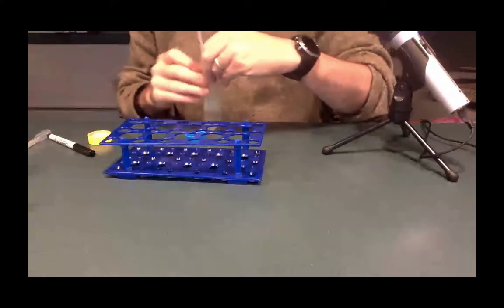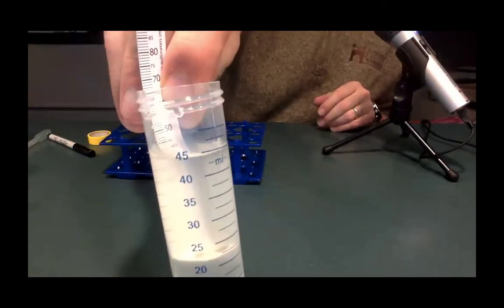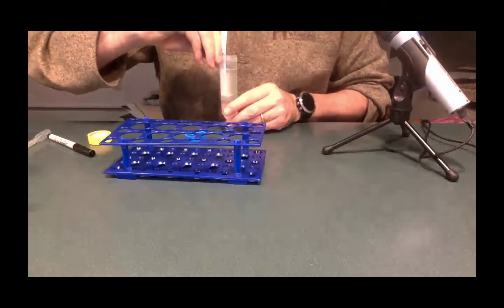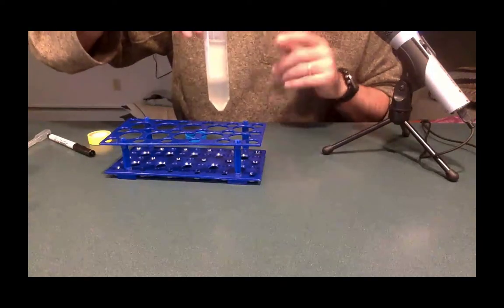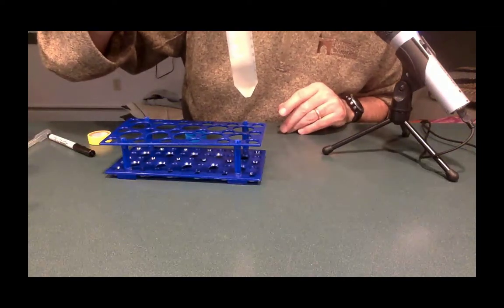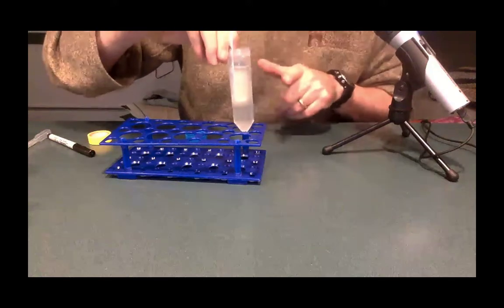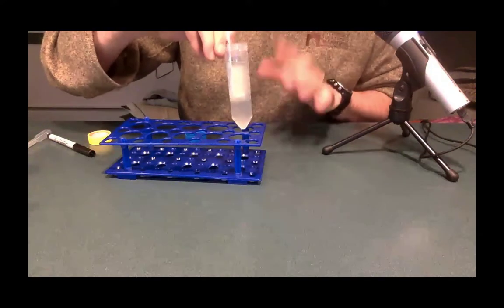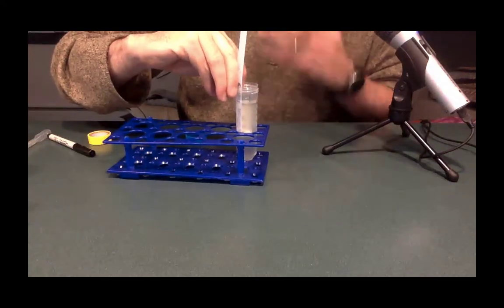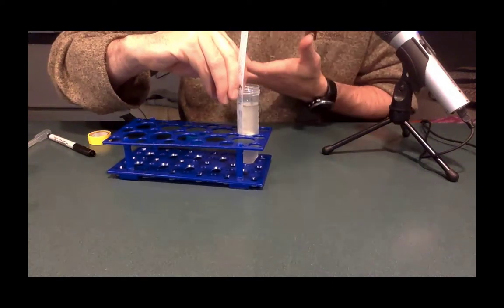So when I hold this up, and I'll try to show this up to the camera, when I'm looking down the barrel of this tube, I can see the little black and white lines until I get down to this point where I've stopped. And at this point where I have stopped, I can't actually see the lines in between the black and the white where that occurs. And as a result of that, I'm deciding that that is the point at which my cloudiness or my opaqueness is sort of the maximum level that I'm going to read, or my reading level.